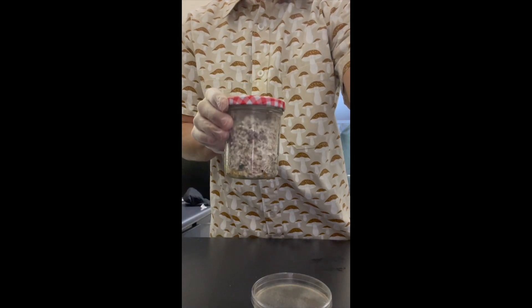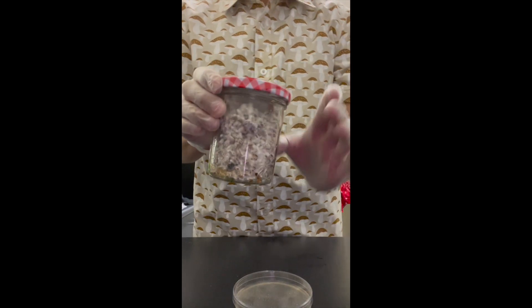Howdy guys, it's Texas Rue here. I have a jar in front of me right now that's actually contaminated, as you can see. It has the nasty green monster that we all hate.